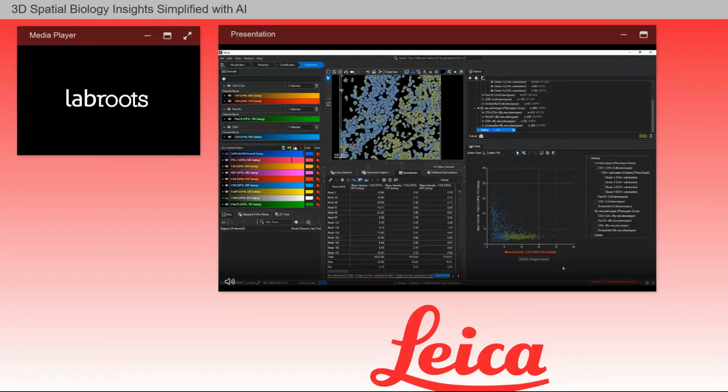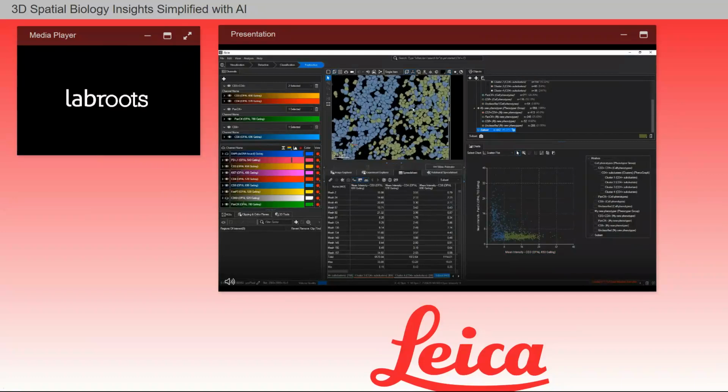Using the scatter plot and rubber band selection to manually gate out objects could be quite useful for those of you working on flow cytometry applications.